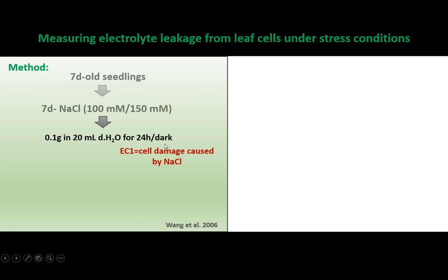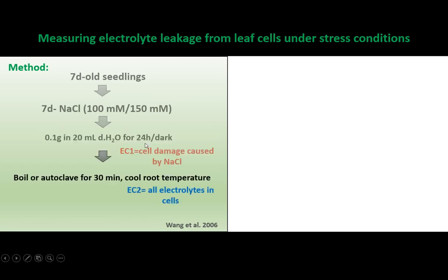We keep these samples in the dark because if kept under light, more ROS can be produced, causing additional damage to the leaves. Next, boil or autoclave these samples in the same solution used for the previous measurement, then cool to room temperature. Take the EC2 or second reading — boiling or autoclaving damages all cell membranes, so EC2 represents electrolyte leakage from all cells.